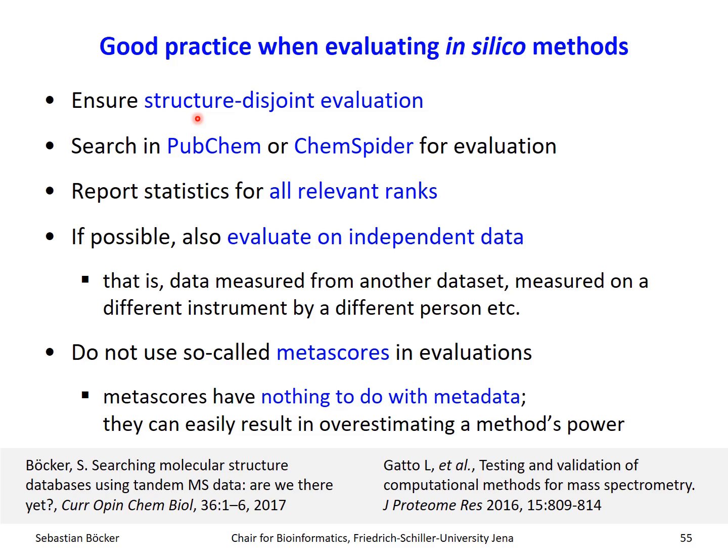And by the way, some of this is written already in here. Okay, and this is also a paper worth reading. It's more from protein research, so proteomics, but the point is their rules also apply to us, like evaluating against other people's methods. We have seen papers being published where for exactly this same task, there are already 10 or 12 methods out there, and they publish a method and it's not evaluated against a single other method or against 2 or 3 randomly picked methods. How is that even possible? How did that go through? Okay, I'm getting a little bit upset here, so I better stop. So good evaluation is super important, otherwise you can forget the results of the paper.